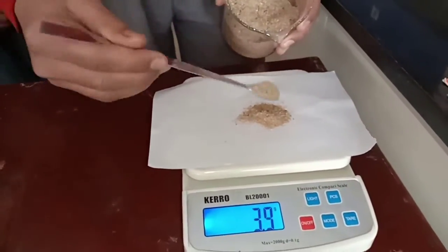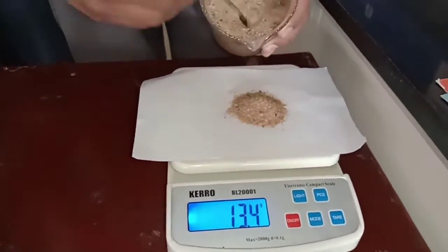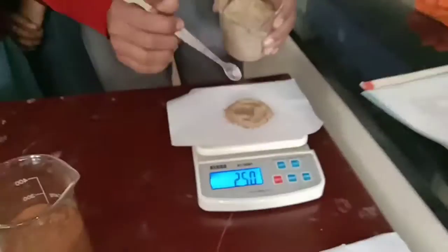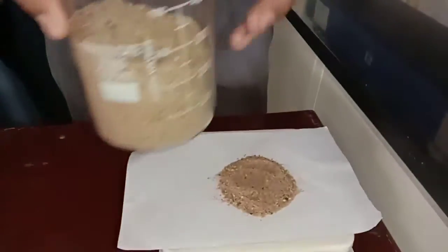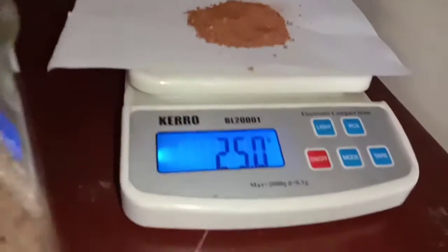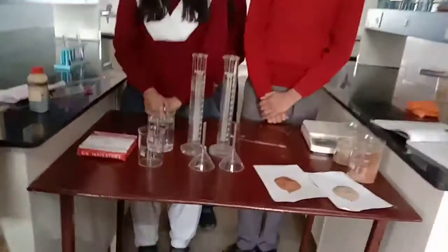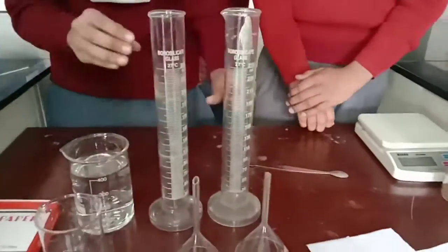So now the procedure. We will take 25 grams of soil from both the soil samples, and we will do the measurement with the help of this electronic balance. So here we have measured and obtained 25 grams of soil from both the soil samples.